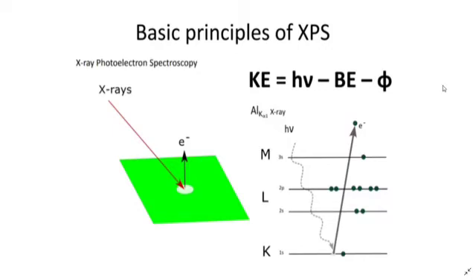So, the basic principle of XPS: to start with, X-rays excite electrons from a material surface. All elements except H can be ejected. The electron energy depends on the element, the electron's orbital binding energies. Then we can calculate atomic percentage and calculate the layer thickness. Small shifts in the binding energy are caused by bonding to different atoms, so the oxidation state of the atoms can sometimes be determined from the shifts.